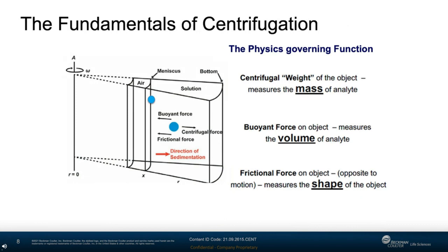Centrifugation is a technique for separating particles in solution using centrifugal force generated by a spinning rotor. Under this force, directed outward from the center of rotation, particles are separated by size and density, with larger and/or denser or higher mass particles moving faster. This force is opposed by a buoyant force because these particles are displacing solution volume as they travel, and by frictional force depending on how much particle surface is interacting with the solution. Each of these interactions are related to analyte, mass, volume, and shape.